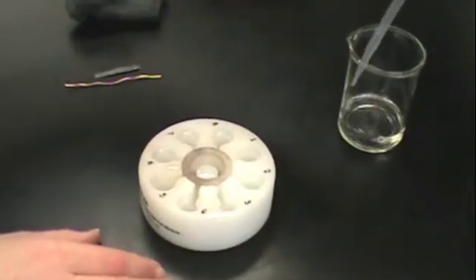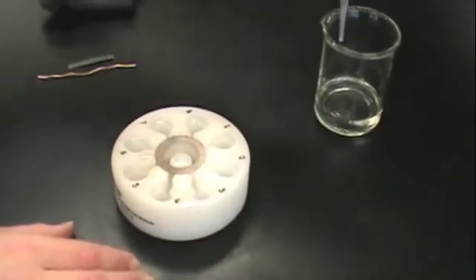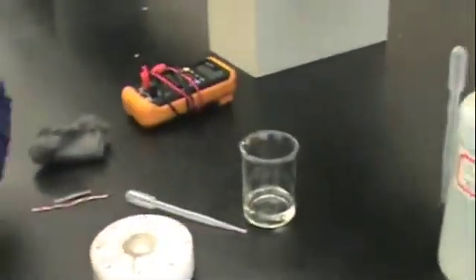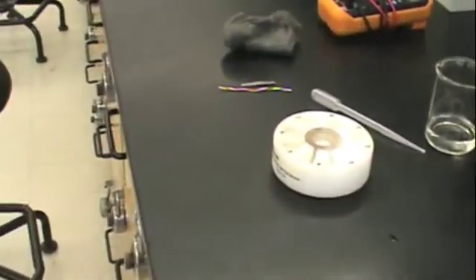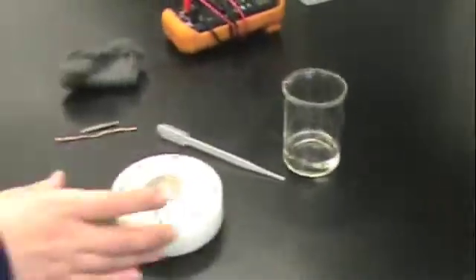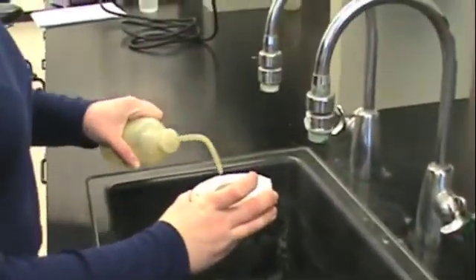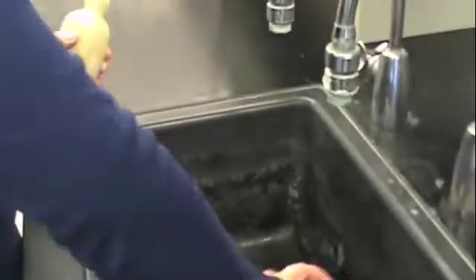Once you have removed all of the storage solution, grab your wash bottle and head over to the sink. Rinse your electrochemical cell at least twice with distilled water and pour the solution down the drain. Once the wells have been washed with DI water, you can dab the well plate with a paper towel.